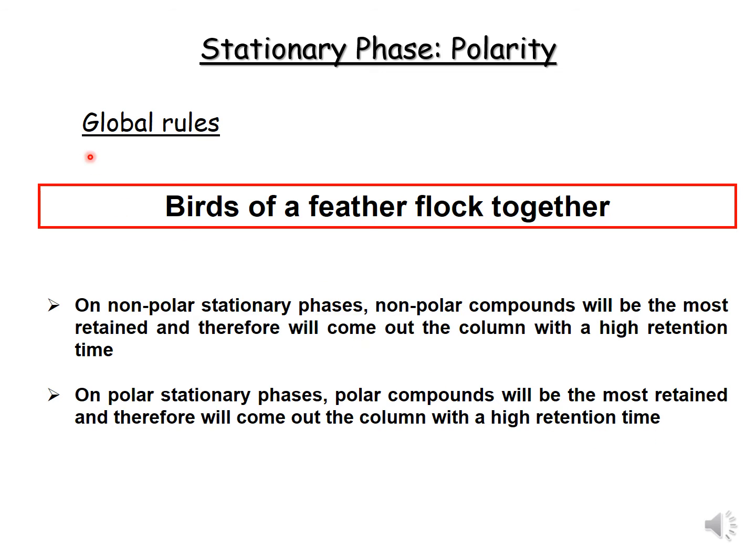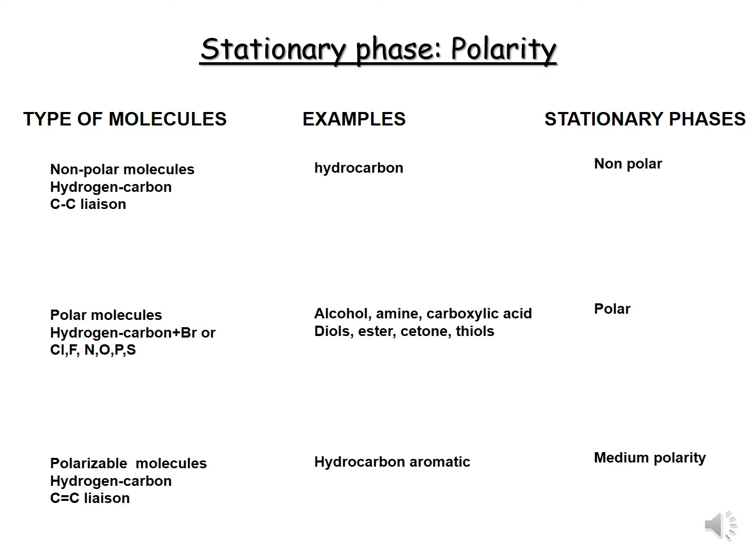It is very, very important to understand these rules, because they have a primordial role in the understanding of the separation. Then here are some examples. I have some examples of compounds with different polarity.